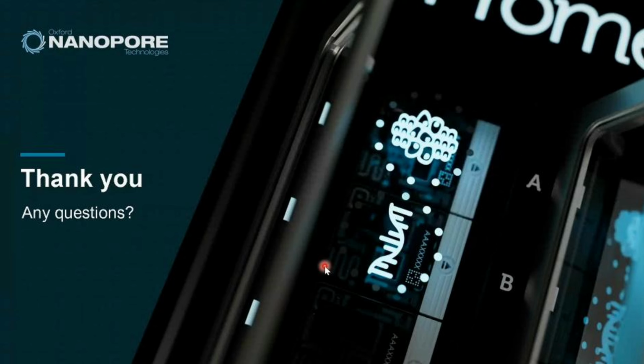One study that I consider more interesting uses metagenomic samples from water, but they are not looking at the microbes, they are looking at fish species in the river water. They use different marker genes to focus on the organisms they are interested in, then amplify and sequence them. We compare to the database to see the identity of what we are interested in, as well as potentially the abundance of this organism.